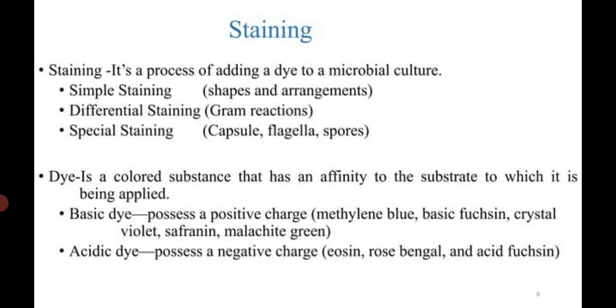Special staining technique: in this staining technique, a particular organ or a particular component of the cell gets colored and we observe it. Capsule staining, flagella staining, spore staining, cellular staining or nuclear material staining are some examples of special staining.